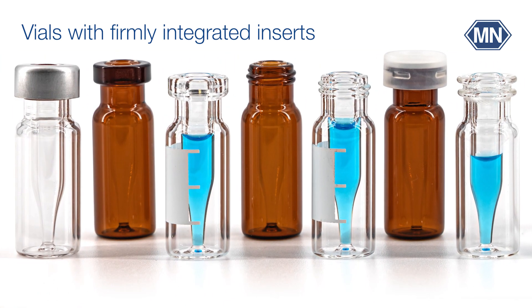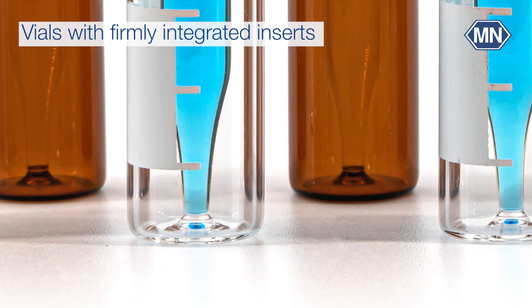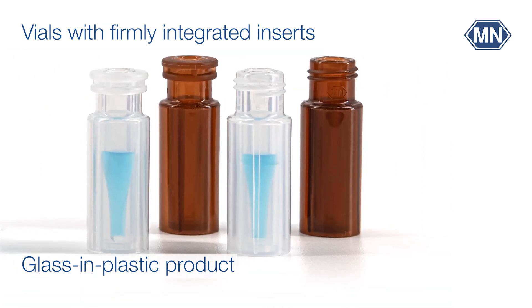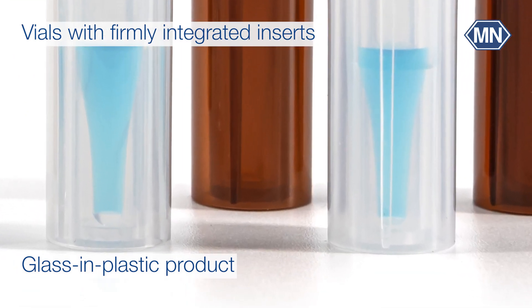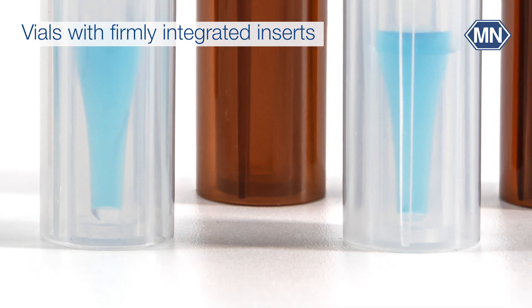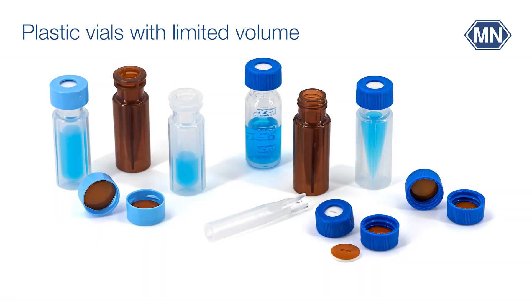Vials with integrated inserts are available as glass-in-glass products, with the insert firmly melted to the outer glass vial, or as glass-in-plastic products, with a glass insert firmly pressed into an outer plastic vial shell for high robustness and an excellent price-performance ratio. Upon request, they are also available with integrated silanized glass inserts.